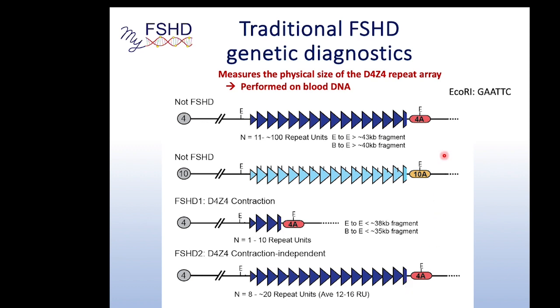So the key is going to be that there are these things called restriction enzymes, and one of the important ones we're going to use is called EcoR1. These are isolated from bacteria. It's kind of a genome defense system in bacteria. So E. coli strain R, enzyme 1, will digest DNA of the sequence GAATTC. So remember, there's 4 bases of DNA, GATC. And so 4 to the 6th, it's a 6-base cutter. Every 4,096 bases on average in a genome, you should have an EcoR1 site. Now that's going to be skewed because this is a repeat.